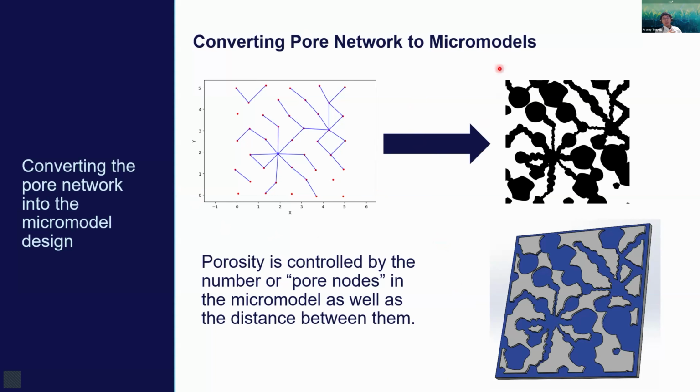In this case, it's an SVG image that will have each of the individual pores drawn as a shape with their designated pore diameter. And same for the throats and all the connections in between. So now we're using our 2D network as a scaffolding for this final geometry with all of the diameters accurate to what the 2D micromodel or 2D network had.